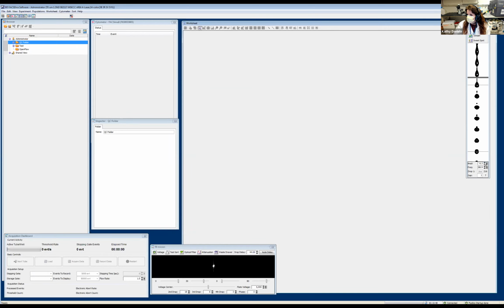Okay, so if I start making changes to the amplitude, what we see is this gray bar right here is starting to get a little bit wider. And what we also see in this window is that the gap value is now at 10. Right here in this text box is where I can tell the software, this is what I want the gap to be if I'm at my happiest, right? If the droplets are looking exactly how I want them to be, I want that gap to be at about 7.